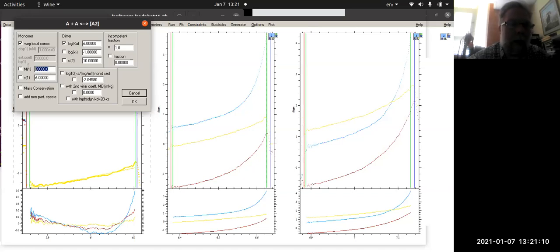In that case, though, I would not want to fluctuate the molecular weight. I would presumably know the molecular weight of my monomer with some sort of surety. And you should note too that in terms of this model of A plus A goes to a quote-unquote dimer of A, if you have a protein that is a dimer and it forms a tetramer, and you know that you can see the dimer and the tetramer at the same concentration, then you should set your experiment up at that concentration and still use this same relatively simple model, put in the molecular weight of the dimer, and then look at the Ka of the dimers forming a tetramer. So you could use the same model to look at higher order oligomers.